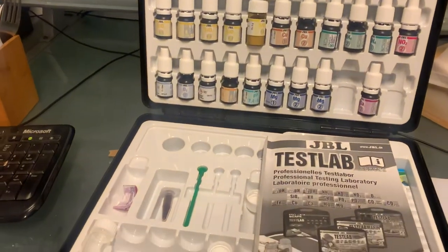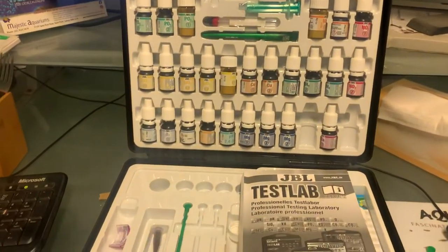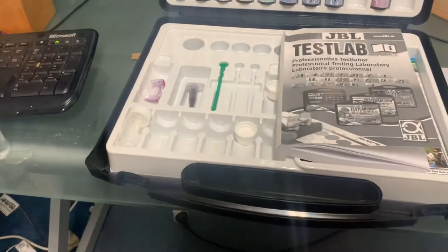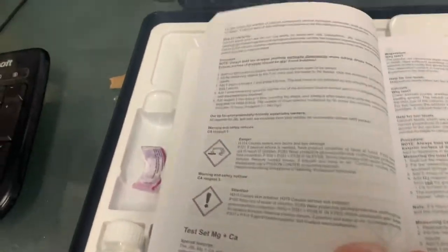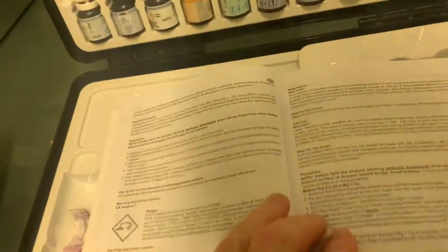Assuming you want to do a magnesium test, the first thing you need to do is have already completed a calcium test. I've already done that, and for the water that I tested it was 340. Moving forward with how to do the magnesium test — you can buy the kit individually or as part of a pack.